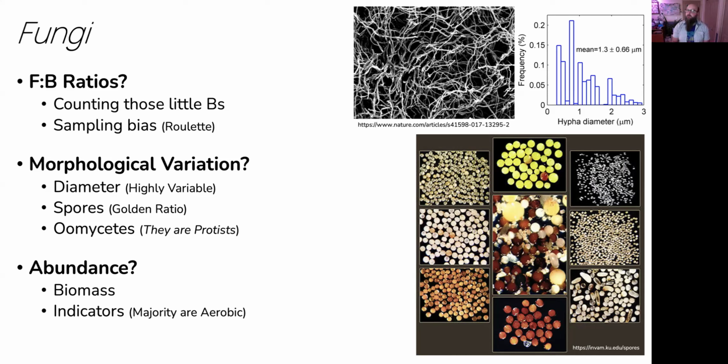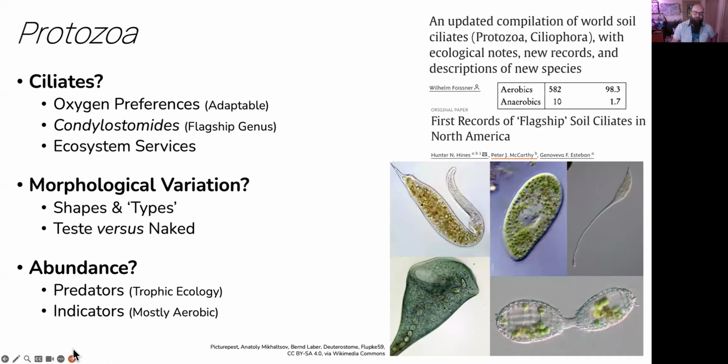I want to see abundance and variation in color and shape and size. And I do know that most filamentous fungi are aerobic. So if I see this huge diversity and array of fungi in my worm compost, I think I probably got the oxygen diffusion principles kind of right here. And there's likely to be the kinds of other organisms I want to see.